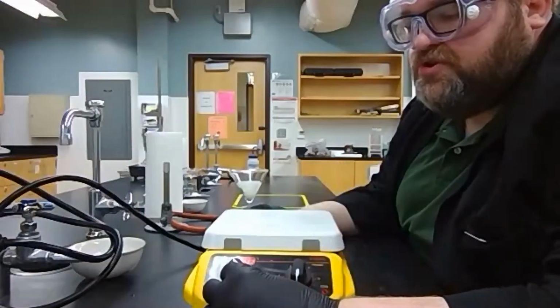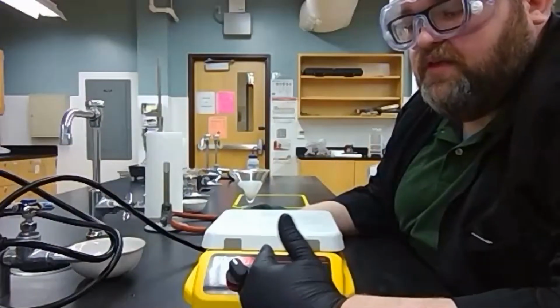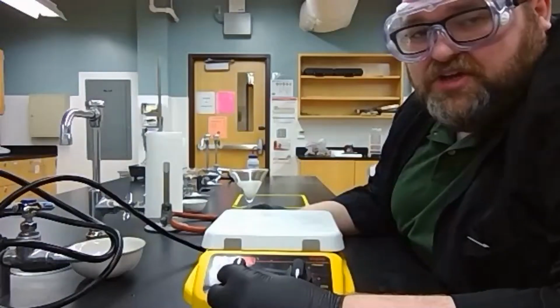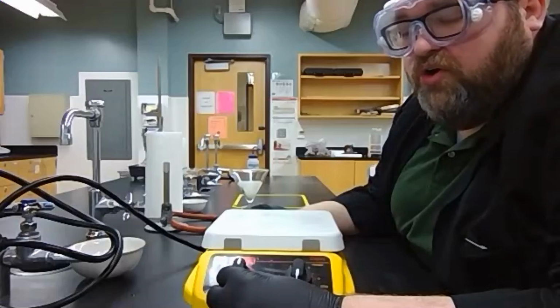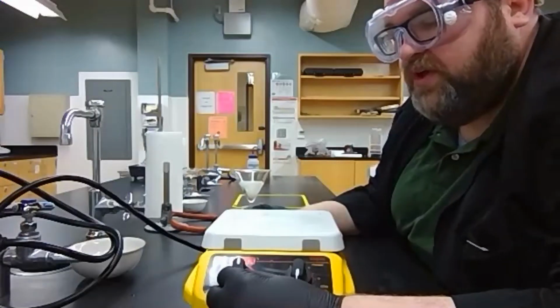So we're going to turn this temperature readout. Water boils at 100 degrees Celsius, and this is given in degrees Celsius. So we want our temperature to be higher than that, but we don't want to burn paper. And remember, that's 451 Fahrenheit. So we need to be lower than that in Celsius, and you do the math, okay?